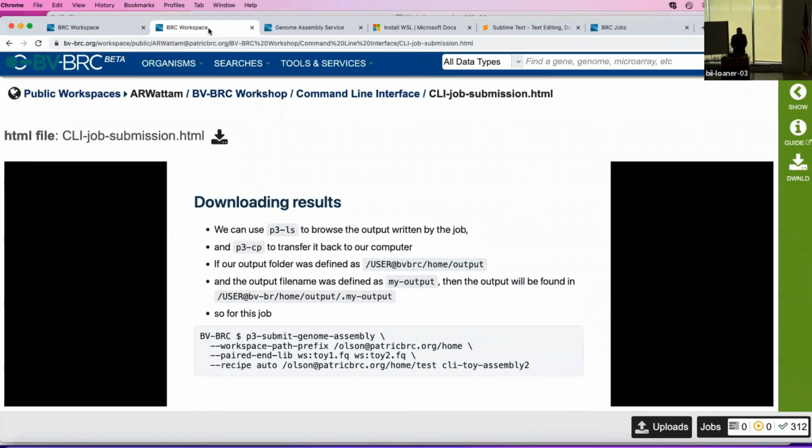You need to say, well, I've got a directory with 1,000 FASTQ files in it. I need to somehow construct a command that has the right set of read library parameters to say whether it's single end or paired end read. I need to decide in my layout of the workspace, where am I going to put the output of these? What am I going to name them? All of these sort of things.